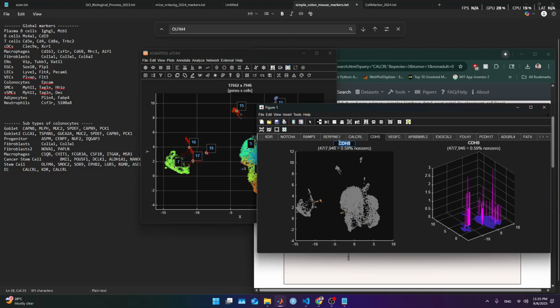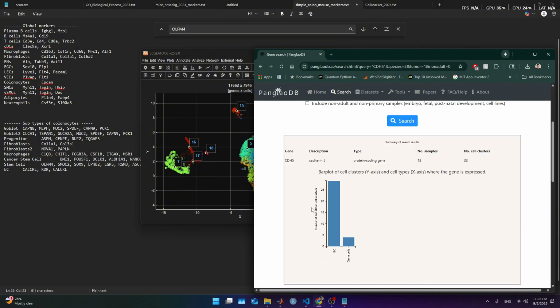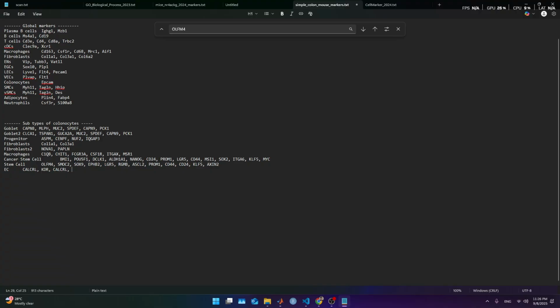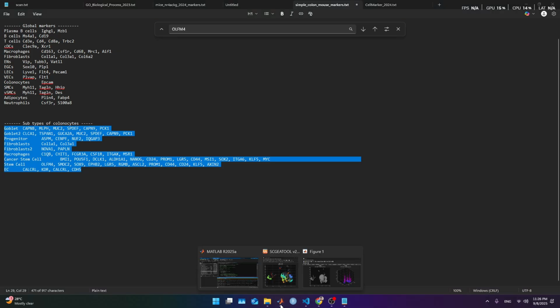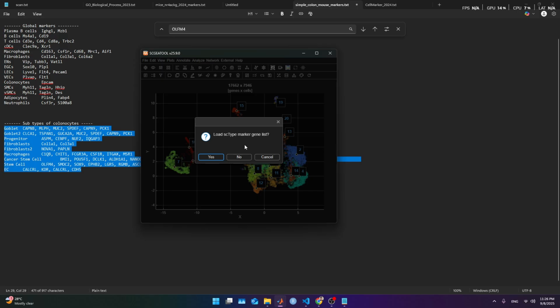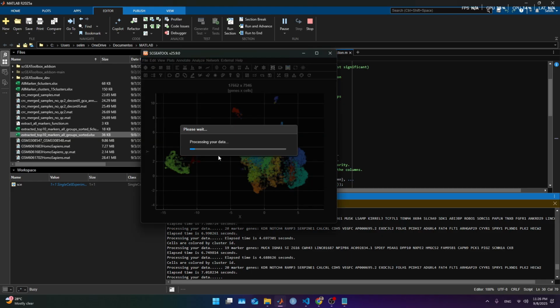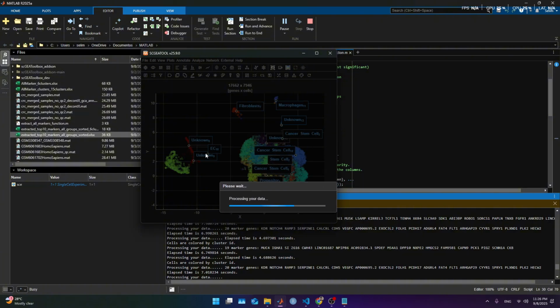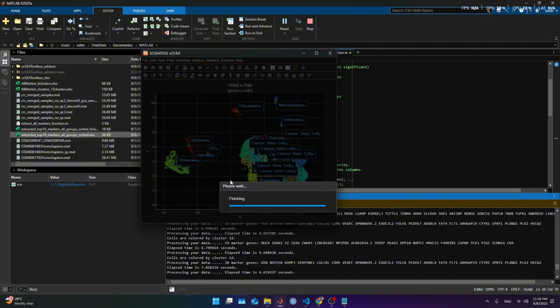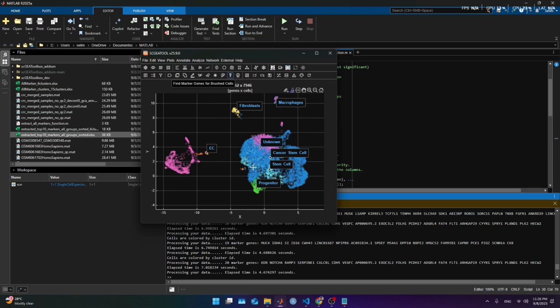Let's look for CDH5. That also rings a bell. Easy, perfect. So we are gonna use this one as well, and I can do things here, but I want to try this automatic annotation to see if we can fix it to the best we can. Okay, that light up as easy. That's a good gene set marker. And merge. And that's how we curate little by little the data set.